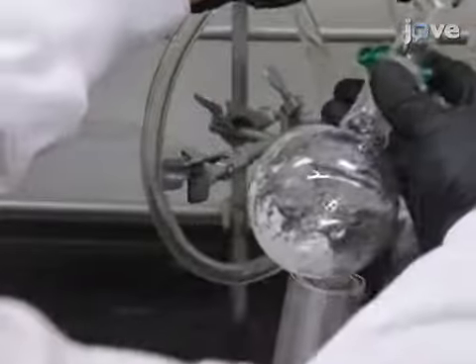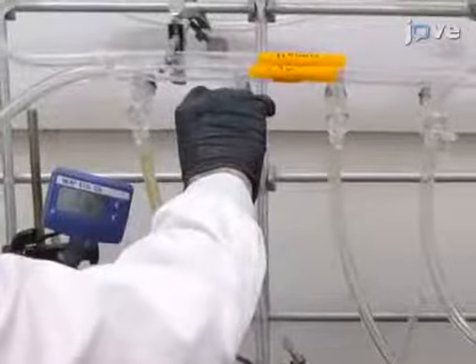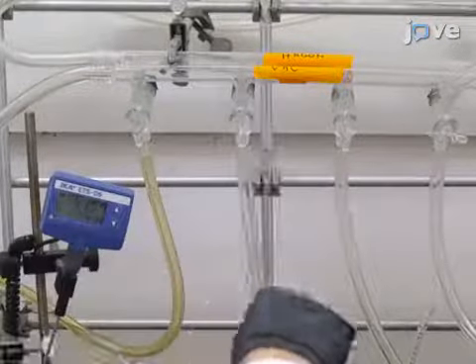Rotate the flask manually and dry the reaction vessel homogeneously with a blow dryer or heat gun until the mPEG melts. After 1 minute, break the vacuum by turning the valve on the manifold towards the argon position with several quick snaps to cool down the flask.